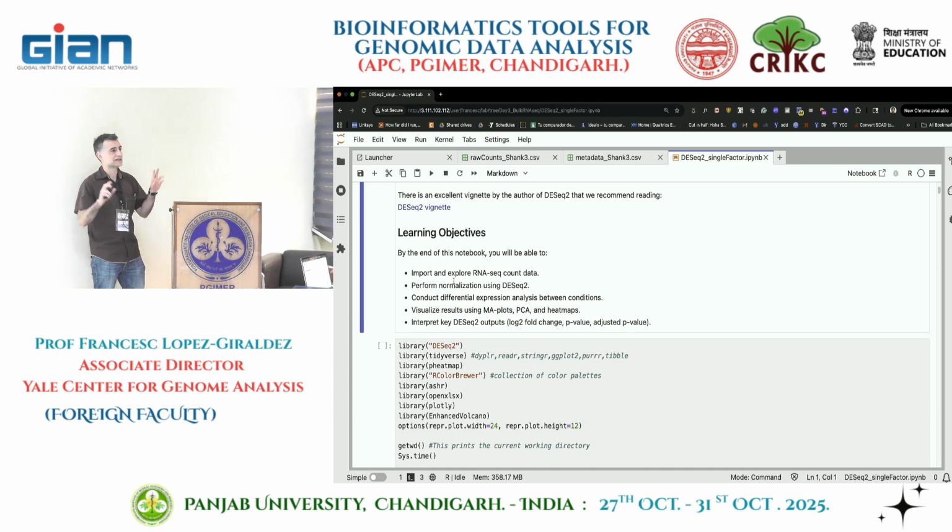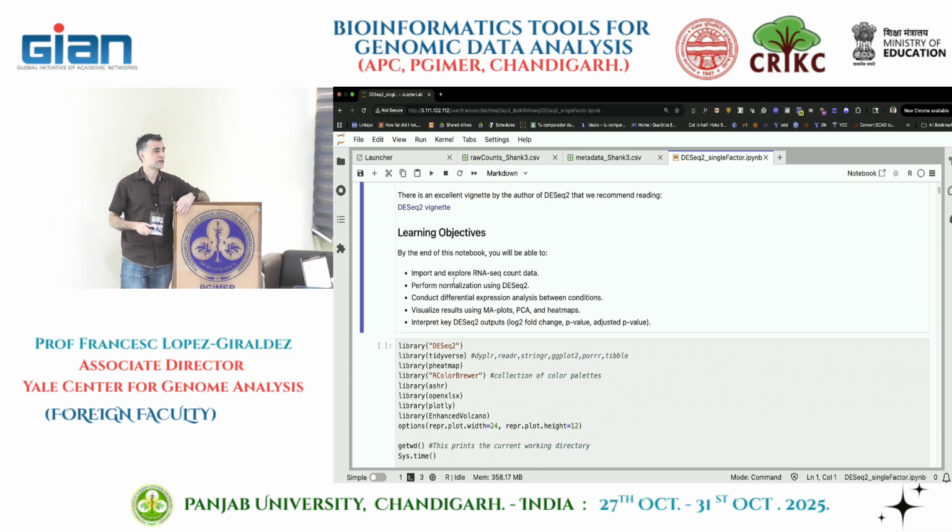But another important thing is, as I said, Bioconductor. Every package in Bioconductor needs to follow some rules about documentation. Documentation is great. They have one thing that I call vignettes, which tells you how to go step by step through the process of doing analysis. DESeq2 is not different. There are still things that are not always in the documentation, because it's something you learn by practicing, right?